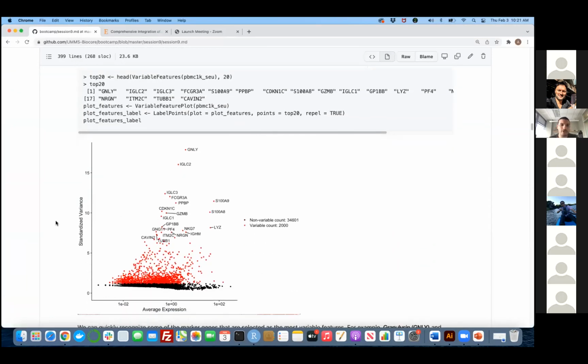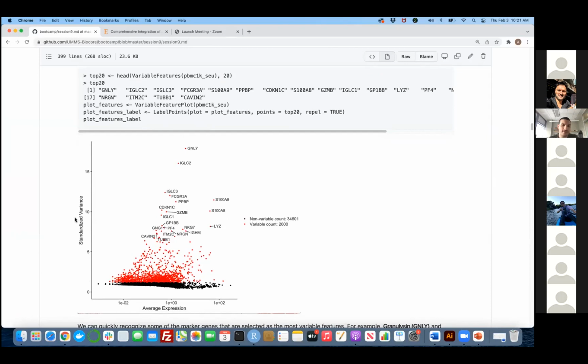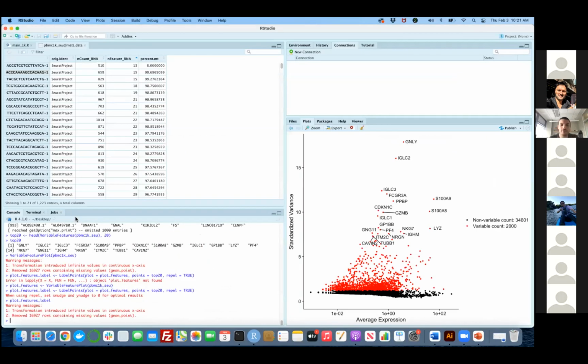This step is really delicate. You have to be choosing your genes really appropriately here. Sometimes when we have multiple cell types that we want to further investigate their subpopulations, let's say when we have T cells, we know that some clusters are T cells. Now we are separating them, and we redo the analysis in order to choose some 2000 genes that are specific to T cells in order to move forward. You have a question?